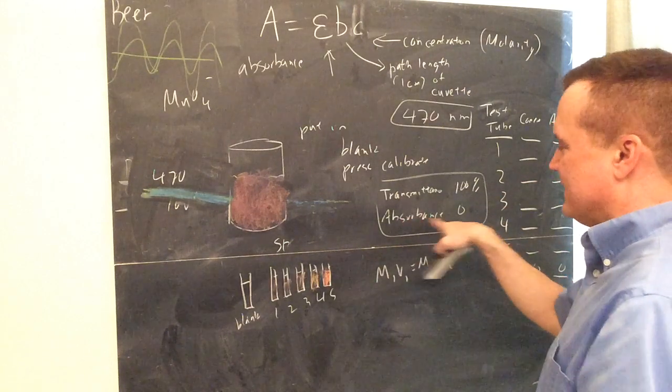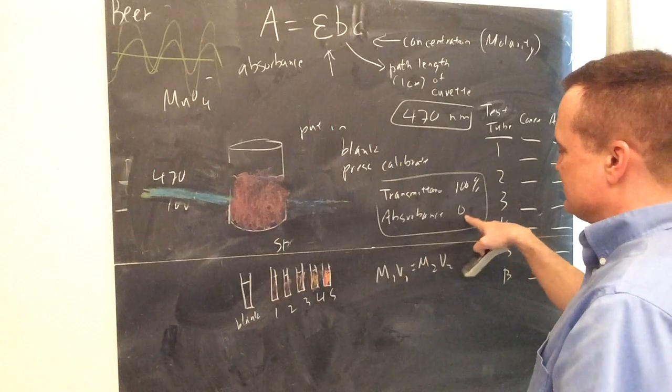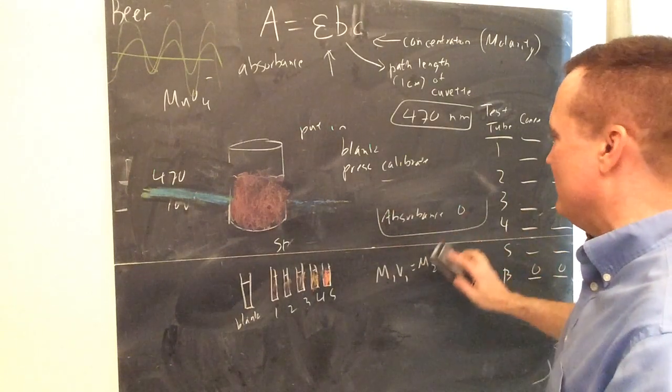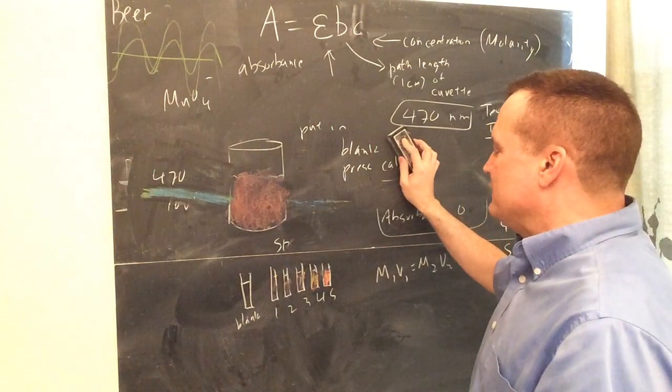You don't even need to know the math formula for absorbance, but it'll be a fractional number. The transmittance, I mean, you see that a lot. You don't have to graph that though. Okay, now I'm going to do that each time.